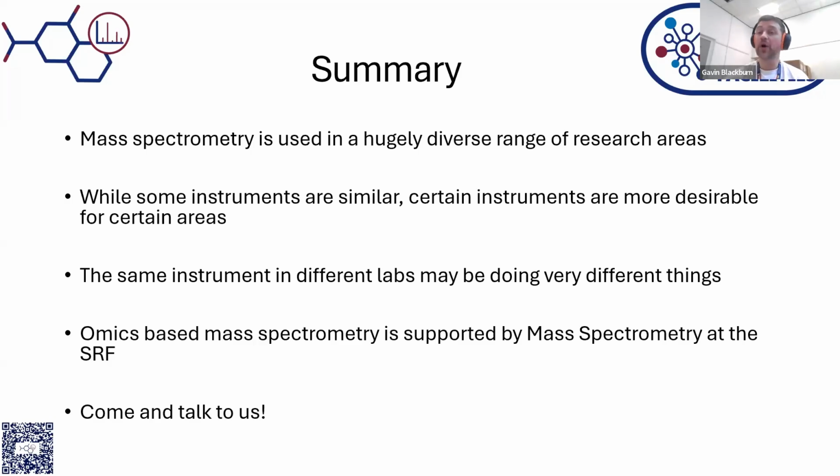My email address is gavin.blackburn@glasgow.ac.uk. If you are based in Glasgow, I am more than happy for you to come across and have a look at these instruments within our lab, where we can discuss what we do with them and show you the instrument. And I do think sometimes, if you're trying to get your head around these experiments, seeing the flow path of your sample, so how the analytes move through that instrument and where they're going to be analyzed, can really help get your head around how these things work. Because if you can understand the mass spectrometry that's available to you, you can definitely get more out of the analysis when you're looking at your data.